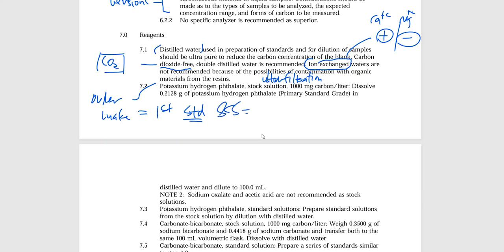So this is something that I have ordered. Maybe it has been shipped to us. It has been made by another third party. We get a little certificate and it says, we tested it and this is what our number is. Here you go. All right. That saves you some work.